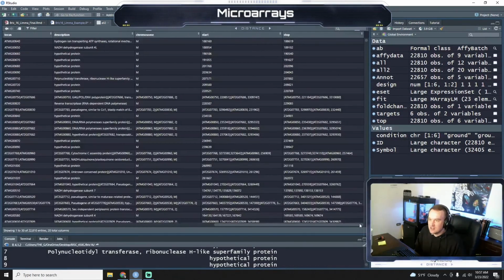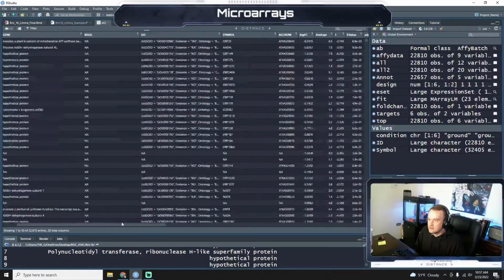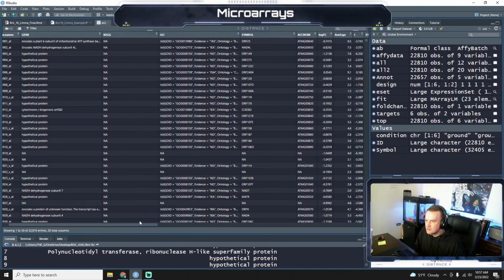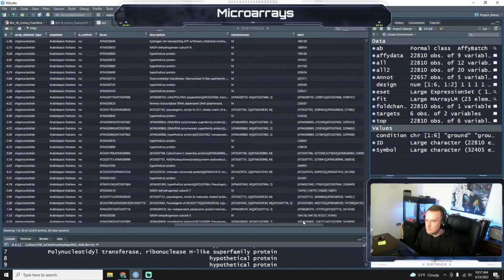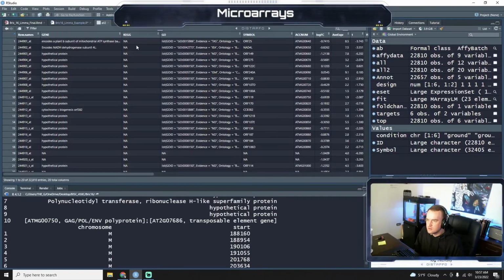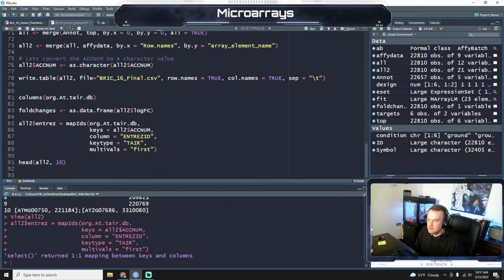So we should have entrez. Do we not? Let's see. All2 entrez. Maybe I did not run it. Did I not run it?